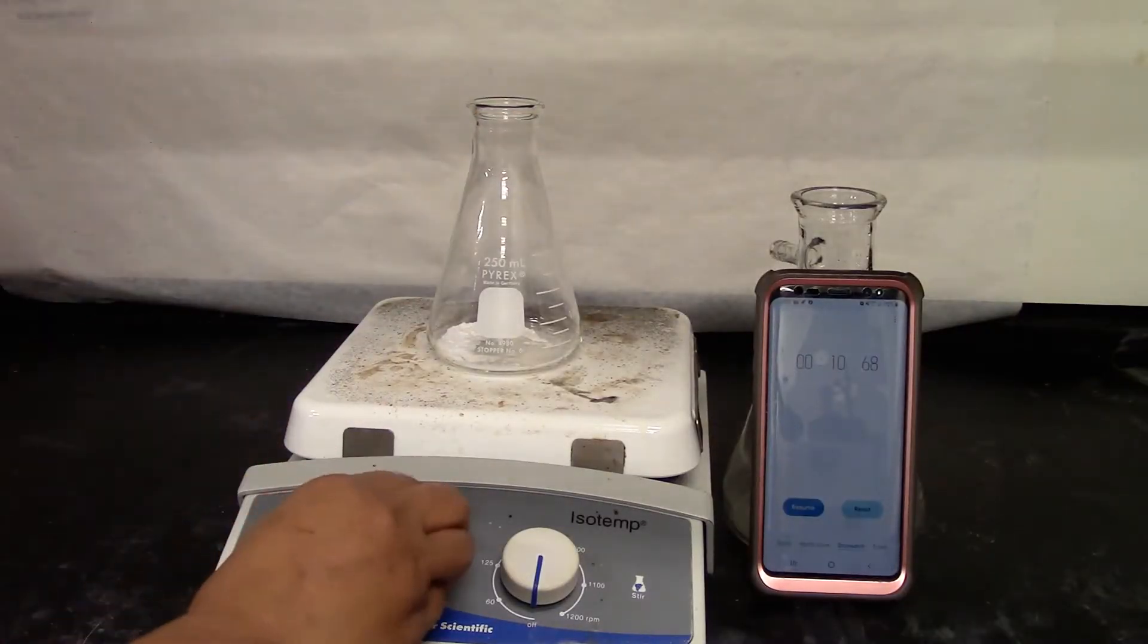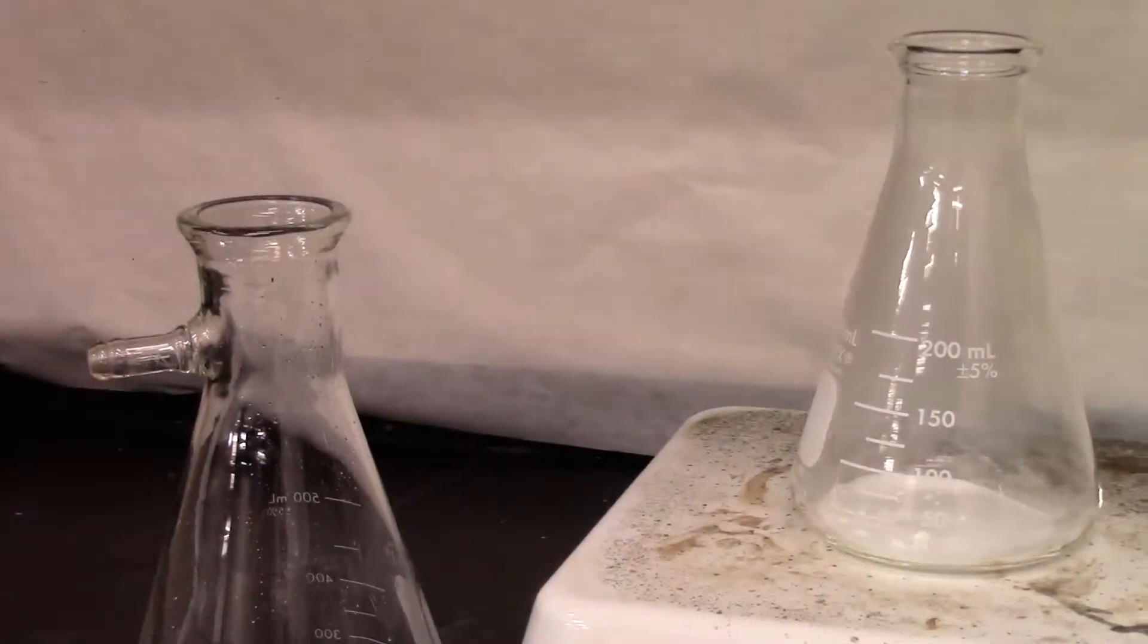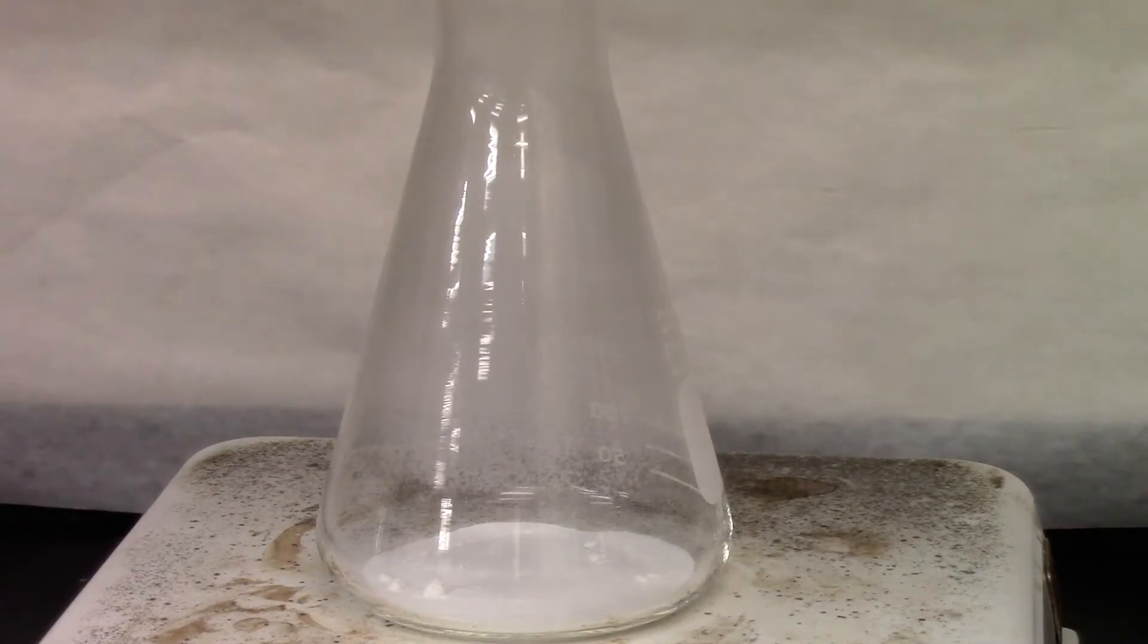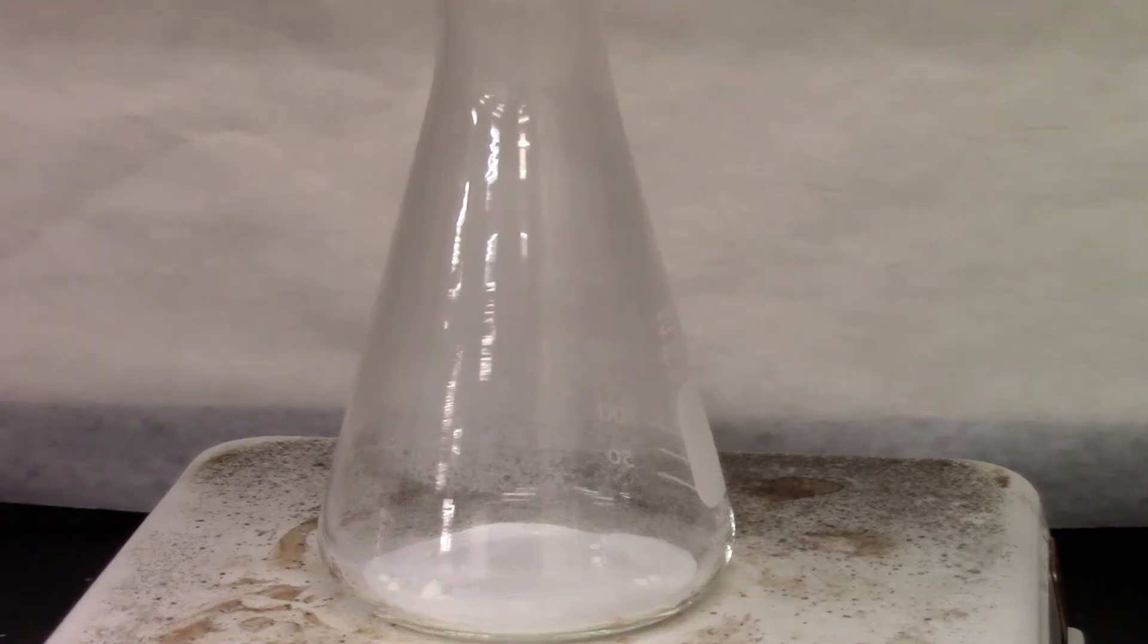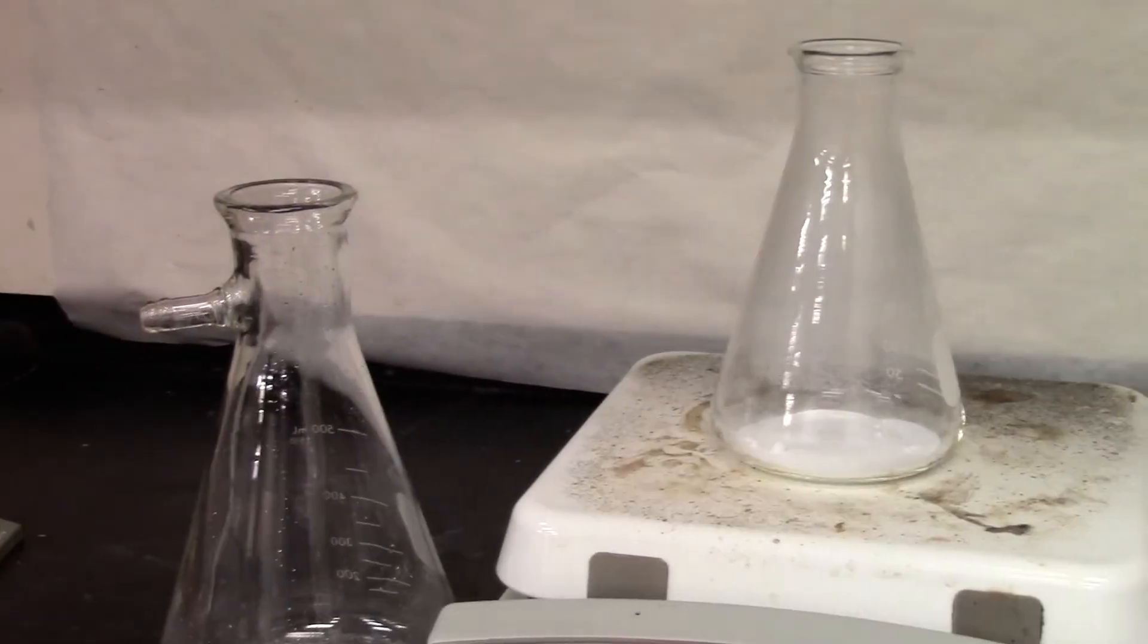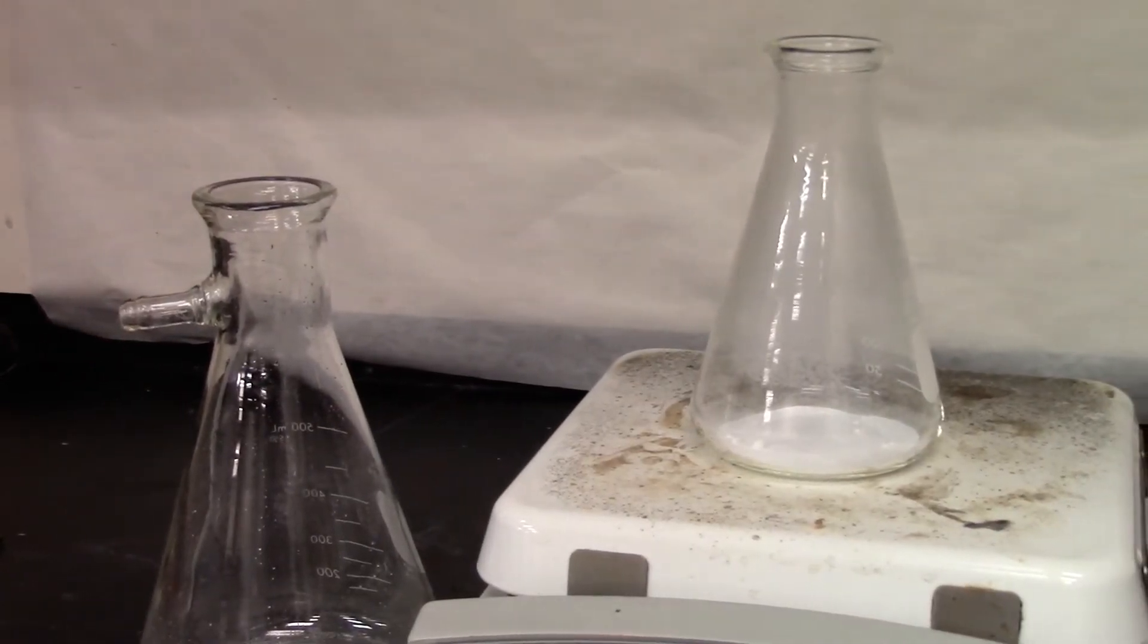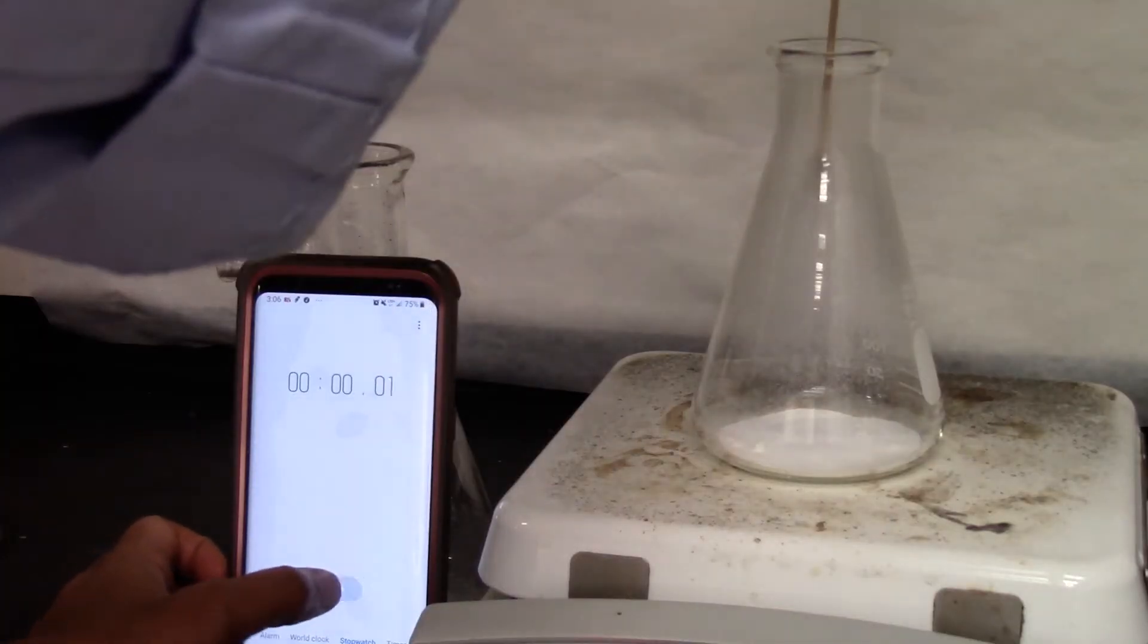I'm going to turn on the heat. So we do see moisture on the inner wall of the Erlenmeyer flask. Now it's a good time to put our splint inside. So it barely burns for a second.